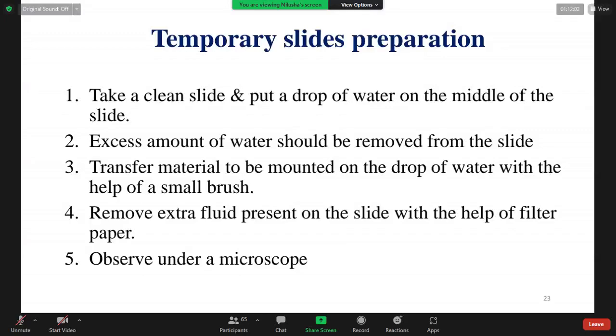If an insect has a soft body, after drying that insect may wilt, so its shape may change, so we can't use that insect for dry preservation. If an insect has a hard outer body cover, we can preserve it under dry conditions. Is it okay?